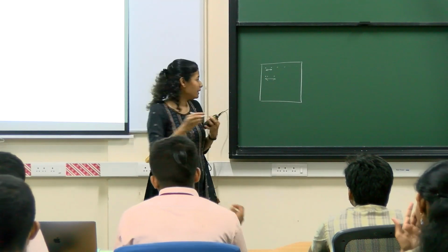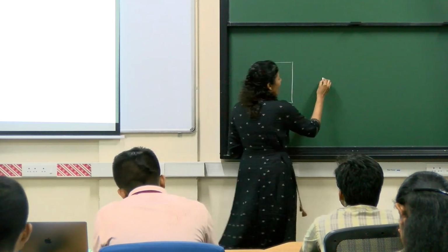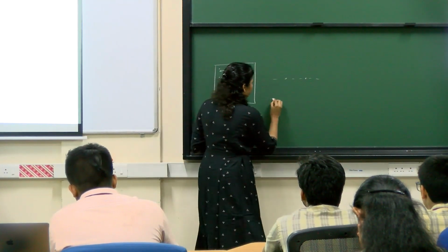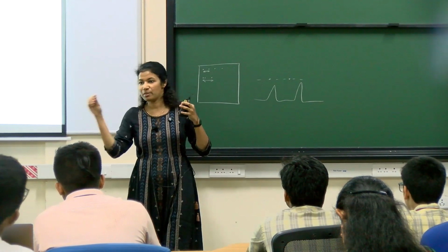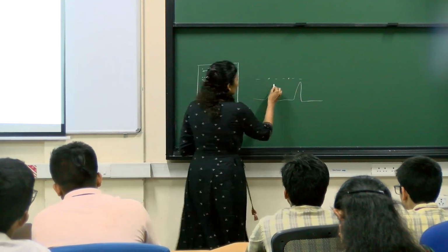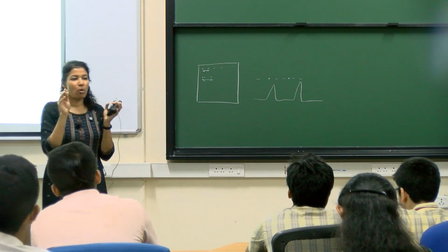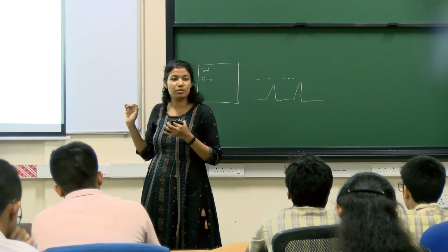So if you look at this in a cross section, if you have 2 dots and I'm drawing a cross section through this, you can see it as 2 peaks, if I'm just plotting intensity, right? So these 2 points, if you can very clearly distinguish, for example like this, then you can say those two spots are well resolved. They are nicely separated, so you can resolve them.